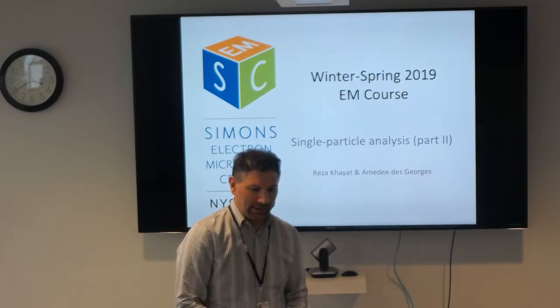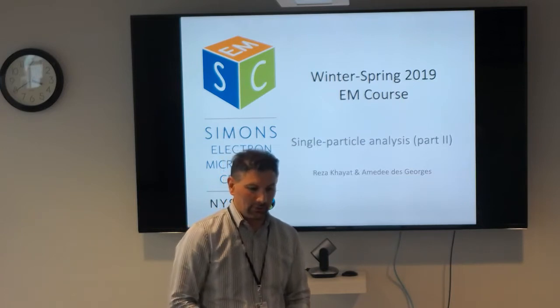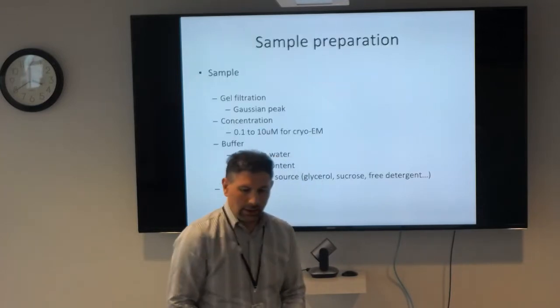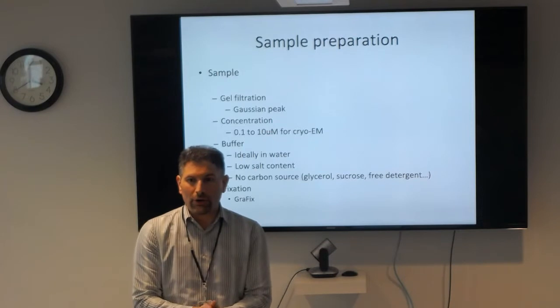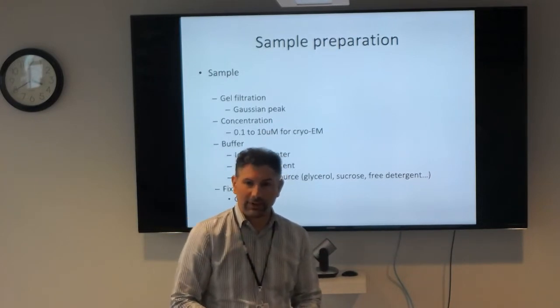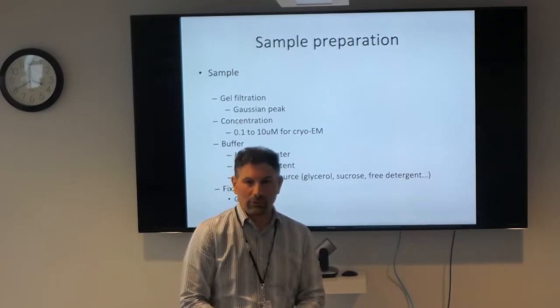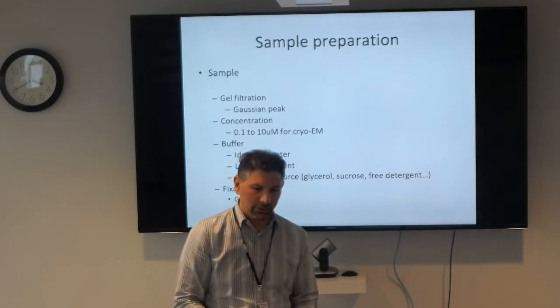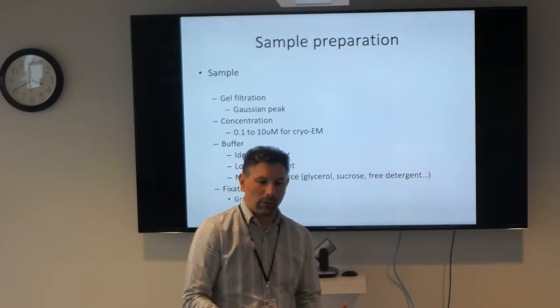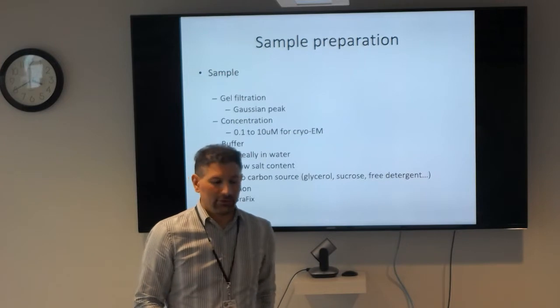Again, let's try to make this more of a discussion rather than me just giving you a fairly short lecture. You have already heard all the hardcore material from Joachim Frank about microscopy, Fourier transforms, image formation, image correction, all that stuff. So this is going to be more of a workflow: how do you go about doing the microscopy, and how do you do the single particle analysis.